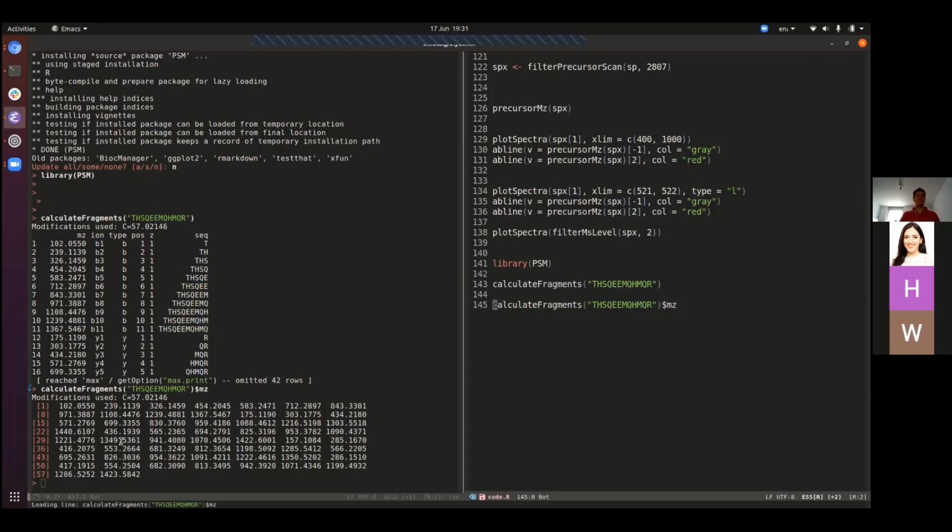These are called search engines. And let me type some of these names here. So there is MSGF Plus, that's freely available. What else do we have? We have something called Comet. We have Mascot, a commercial one that is widely used. There are also MetaMorpheus. Anyway, there are many, many more, too many to cite here.